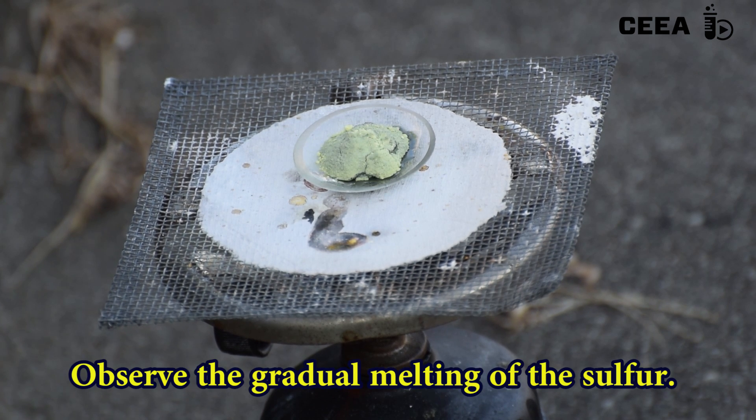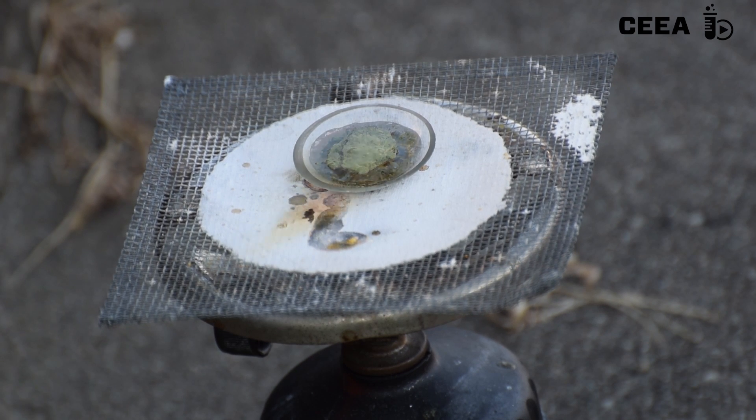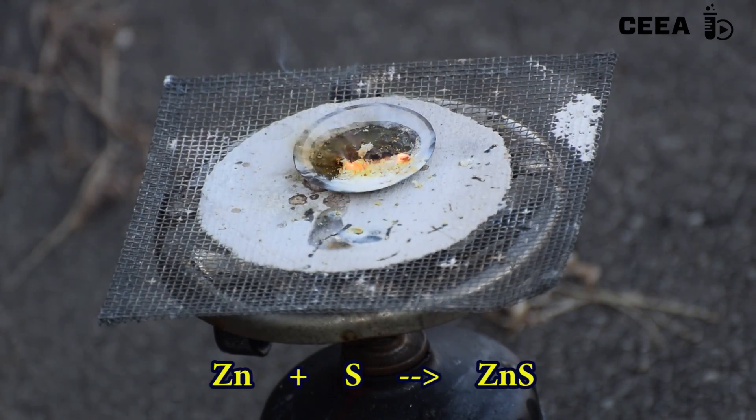Notice how the sulfur melts. When it's hot enough, the chemical reaction begins. Zinc combines with sulfur, giving zinc sulfide.